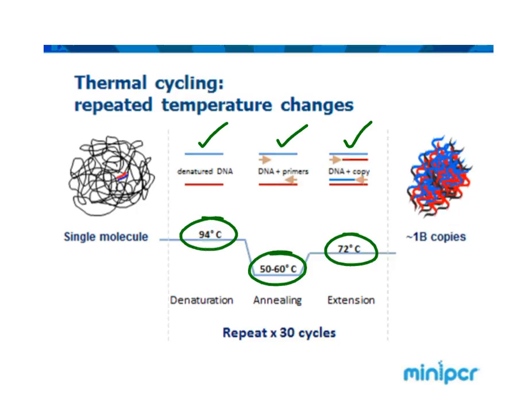And you're thinking, well, how can this enzyme work so well at such high temperature? The reason why is because the DNA polymerase that we're using actually comes from a certain organism that lives in hot springs. So 161 degrees Fahrenheit or 72 degrees Celsius isn't anything. That's a nice and relaxing temperature for it, so it's able to do its job.